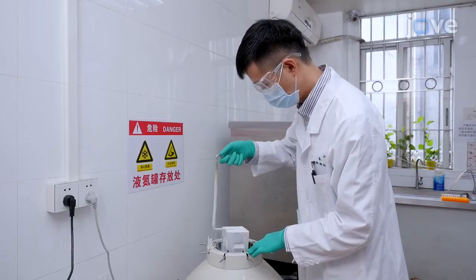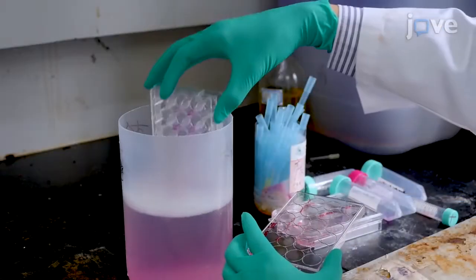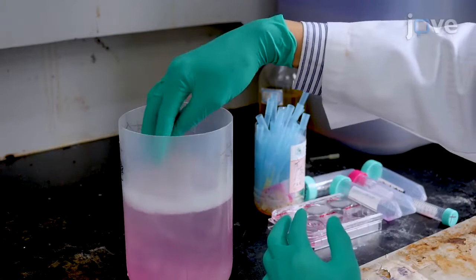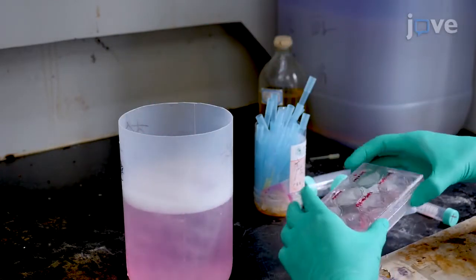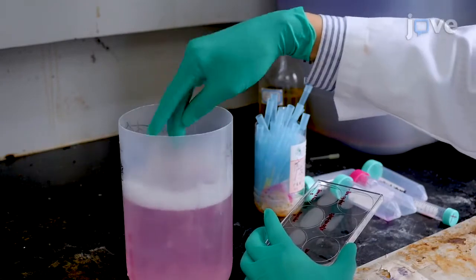HBV infection should be performed in a biosafety level 2 or biosafety level 3 laboratory. Laboratory safety practices should be followed to ensure the safety of laboratory personnel, and all researchers should be vaccinated and detected HBS antibody positive before performing HBV experiments.